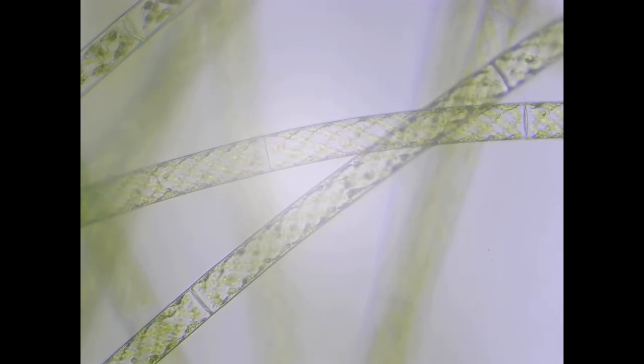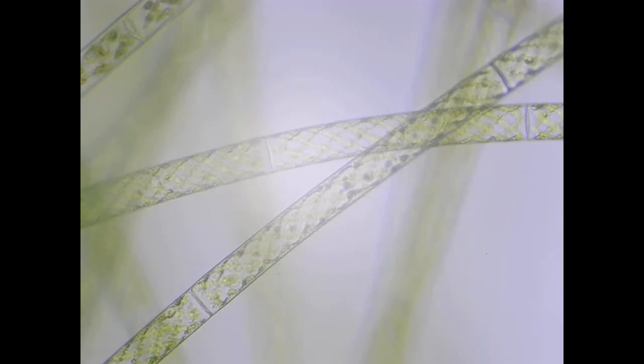Like other green algae, it contains chlorophyll a and b, produces oxygen and serves as a primary producer in freshwater ecosystems. Spirogyra reproduces by fragmentation. The filament breaks into pieces and begins to grow into a new filament.